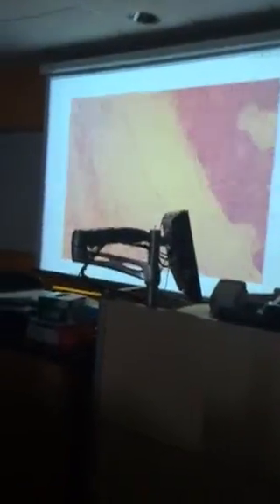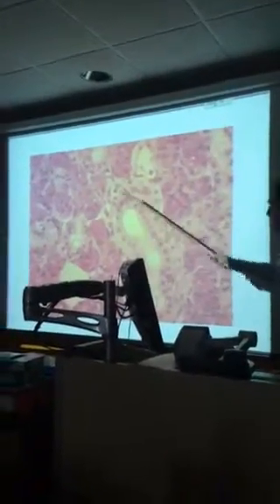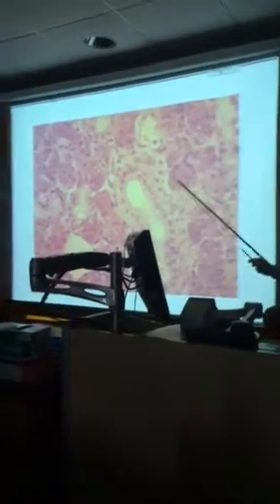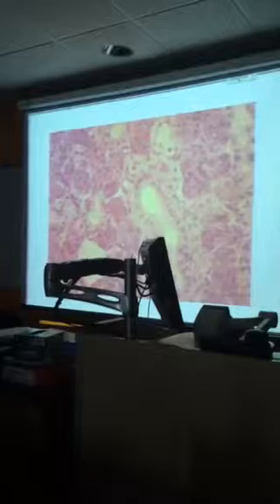Okay, there's something else I'd like to see. Again, here more salivary gland ducts you can see. That's a fat cell over there. Again, serous cells, and then the mucus cells, the lighter stained ones.